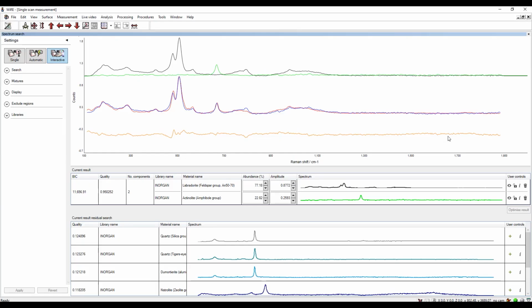So it's really easy if you've got just one material to be able to library search and identify that material, or whether maybe you've got a combination and you want to understand all the materials that might be present within the unknown. Next, I'll pass over to Ricardo to talk through more detailed examples of how gemstones may be treated or modified.